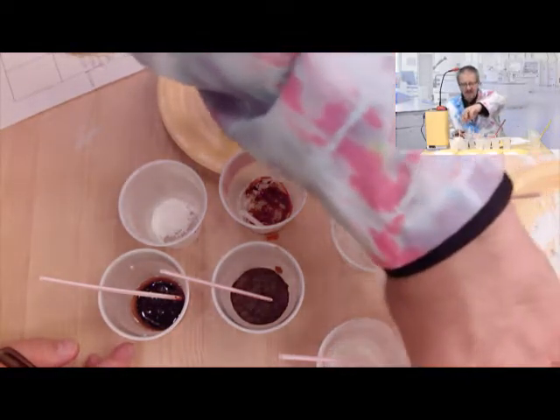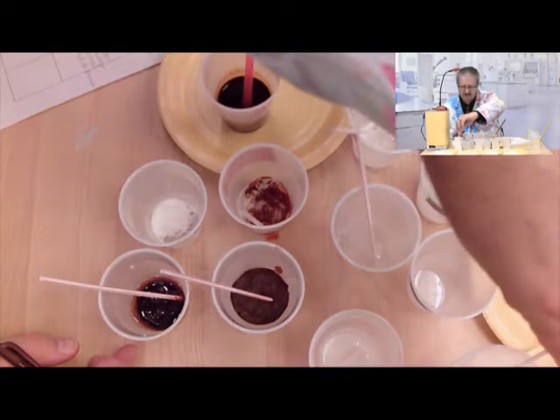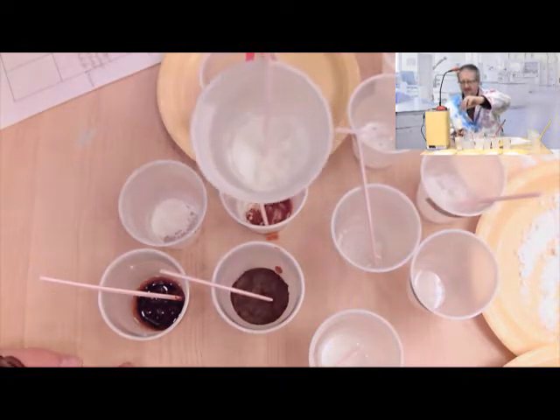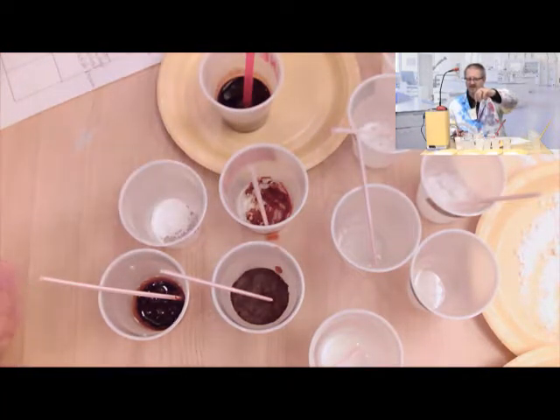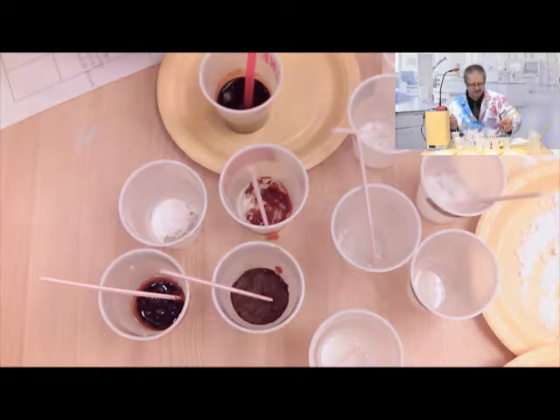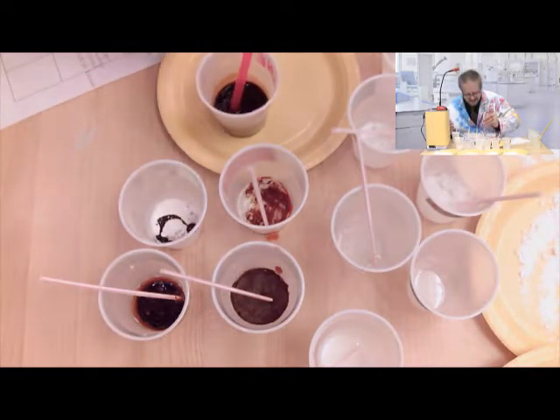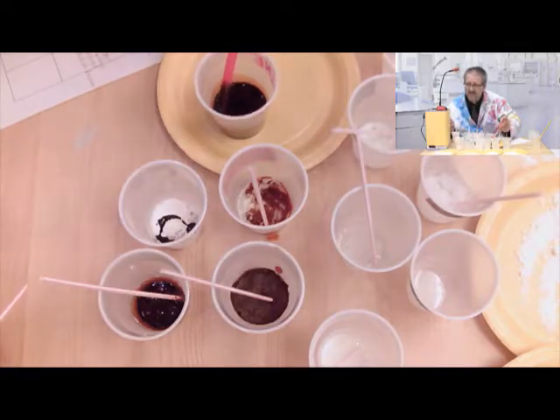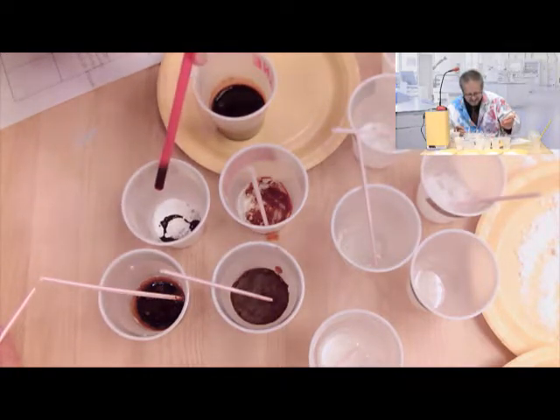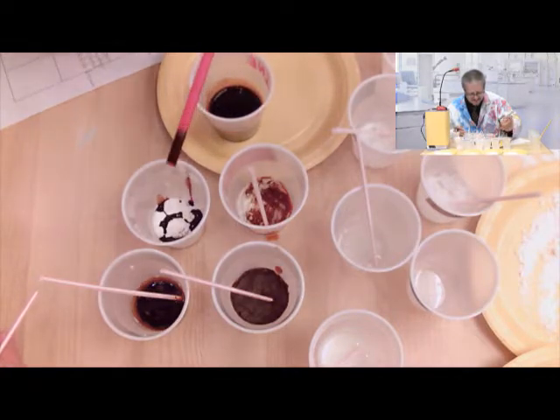Move this aside. I'm going to use my D water stirrer here. Whoa, look at that. This is the D water. It's like a glue. It's like a cement in there. Okay. So I'm going to use the other end of that to stir my iodine. That was weird. Did you see it shoot right across the top of the powder? It seems like it doesn't want to mix.